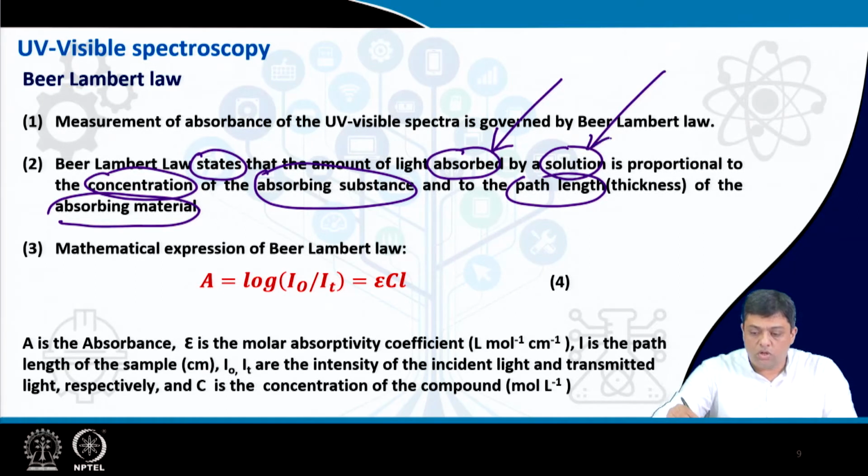Solution. So, you are talking about the measurement probably when the sample is dispersed or you have formed a solution, is proportional to the concentration. So, if you have high concentration of material in the solution, then the response may be different from the condition when the concentration is much lower.